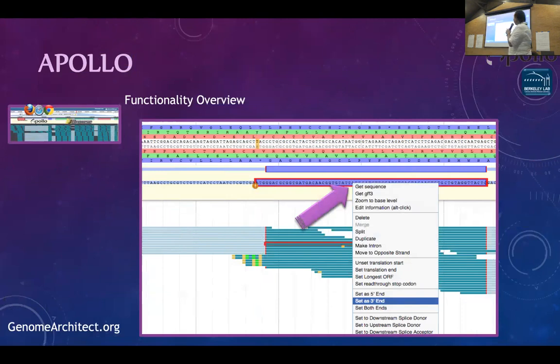In this case, actually, the transcription evidence shows us that the canonical splice site should be up here instead of down here. So if you see this red line that I am showing here that I've kind of highlighted with the laser, it shows us that the actual gene model should follow what the majority of the reads of RNA are telling us, and it is that the splice site is located in this base pair, so that the TGAT is here.